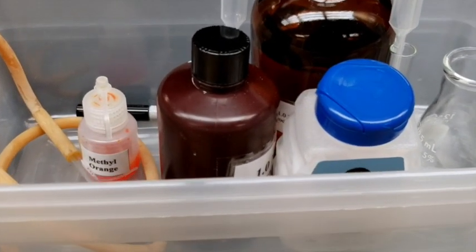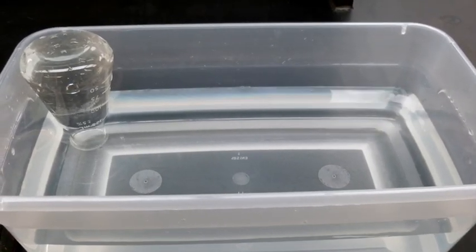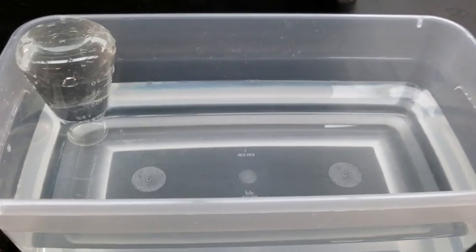First, you will receive a trough that contains the chemicals. Remove the chemicals and fill it up with water. Fill one of your 125 milliliter Erlenmeyer flasks with tap water and invert it into the trough.